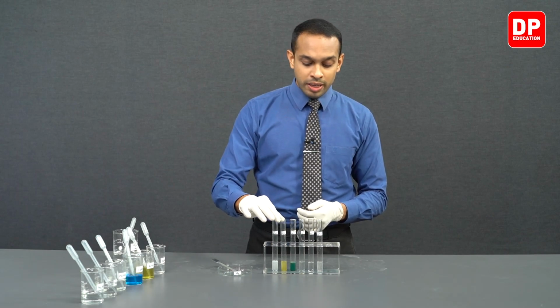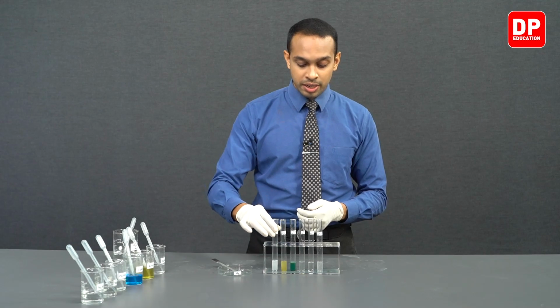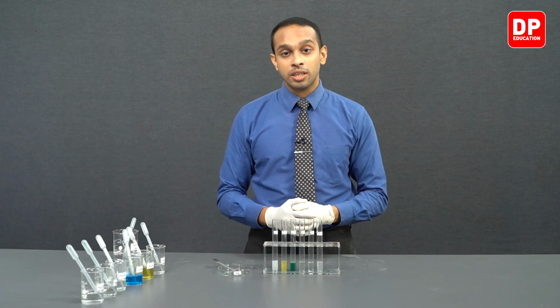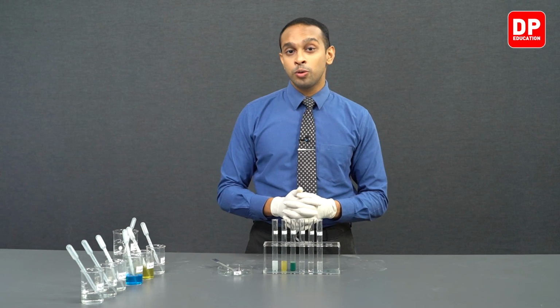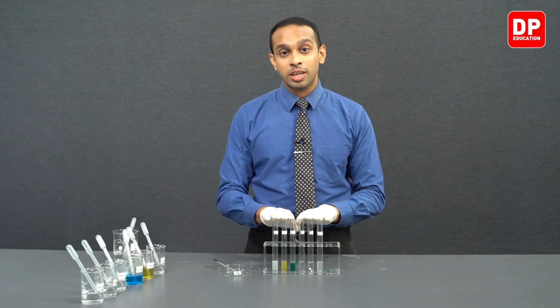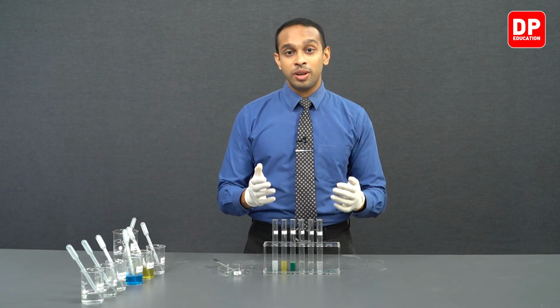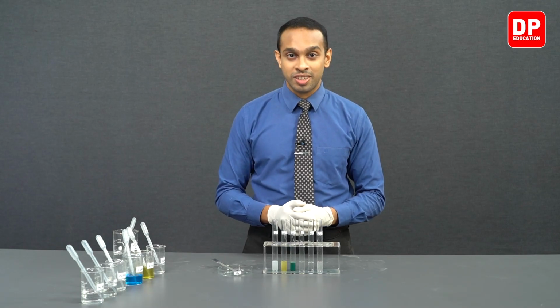So students, over here, if you allow these reactions to take place for a while, you will observe a small color change in certain solutions as well as certain precipitates being formed. So for those types of reactions to happen, we will allow this reaction to take place for about 10 to 15 minutes. And after the reaction has taken place, and when we have a very clear observation, we'll come back and talk about the observations.